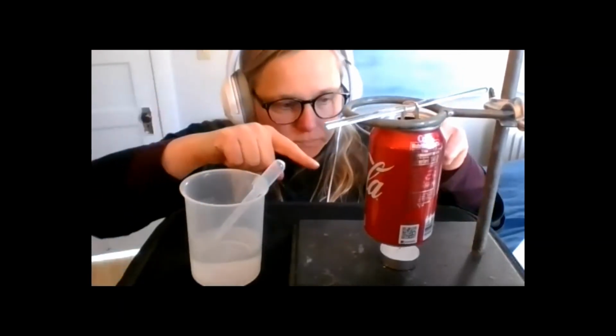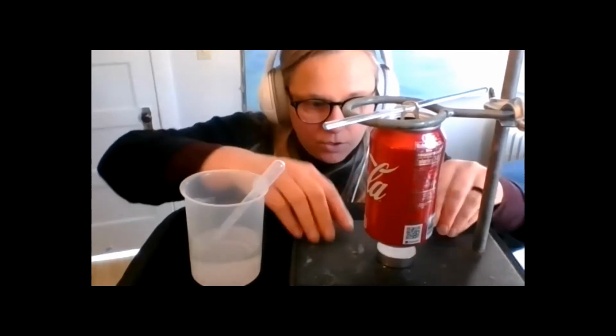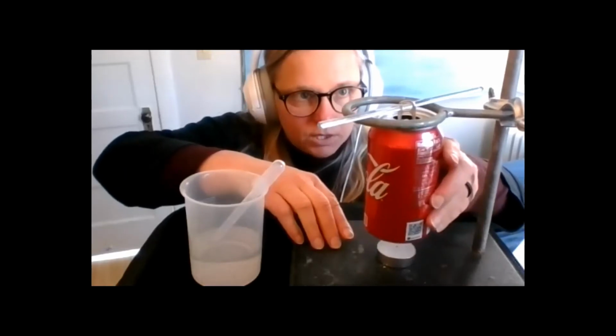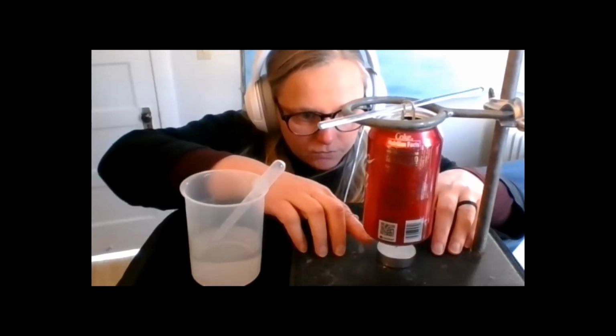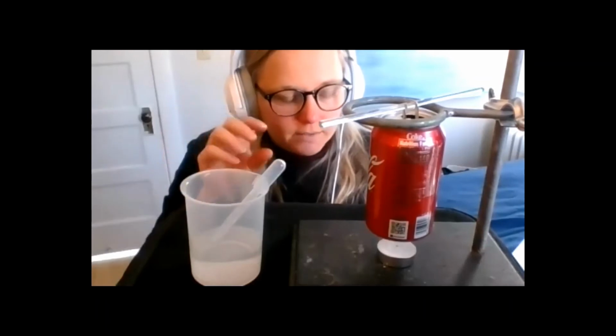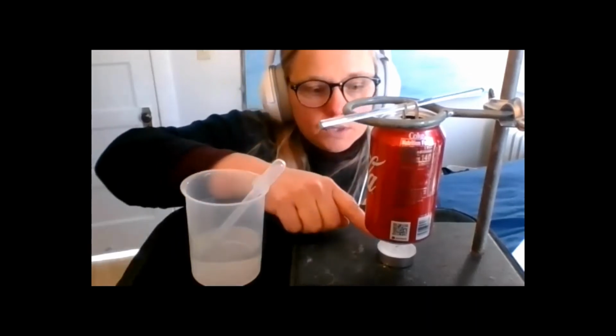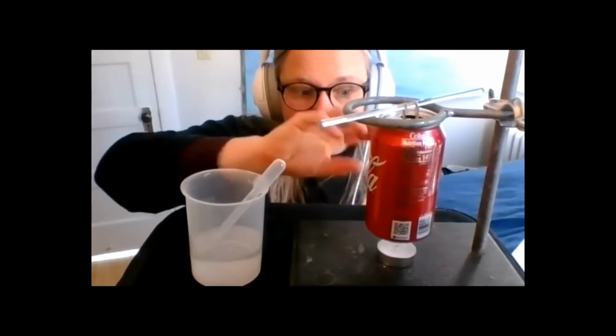And we're going to get it nice and close. I say to do like 3 centimeters. It could be even closer. 2 centimeters is fine. 2 to 3 centimeters from the top of the candle to the bottom of the can. You want it nice and close so the flame is just right on the bottom of the can. So what we're doing is we're capturing all that energy and putting it into the water in the can.